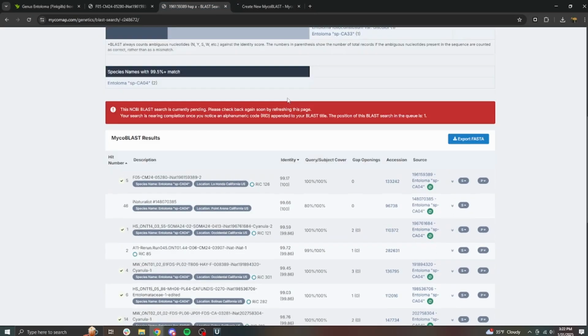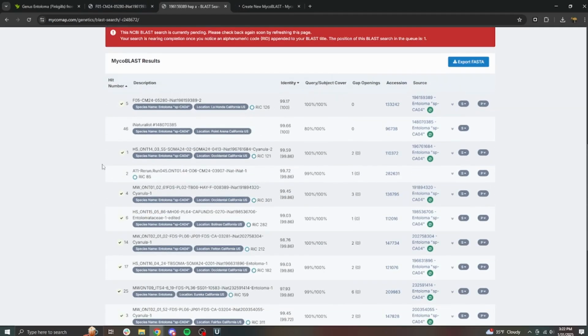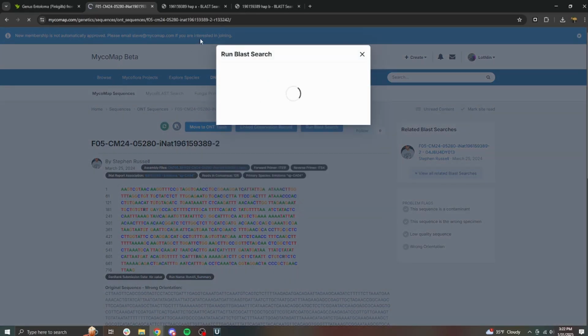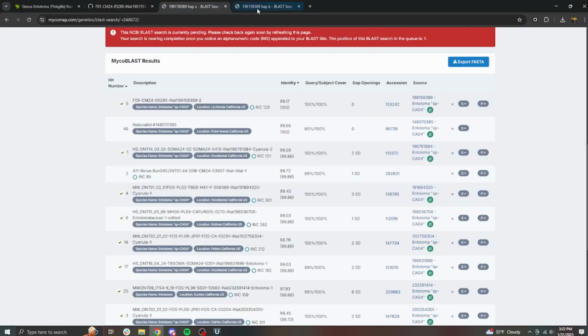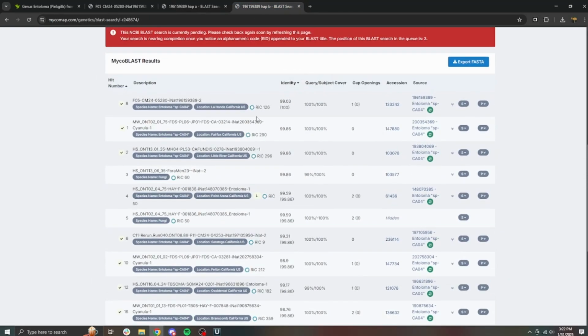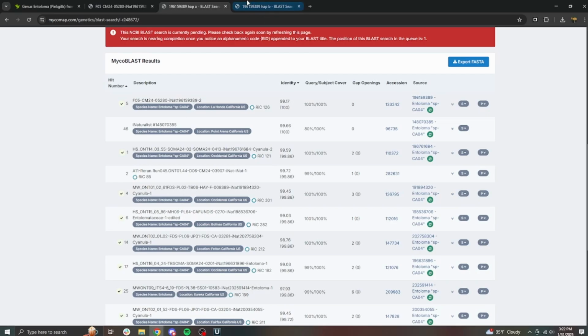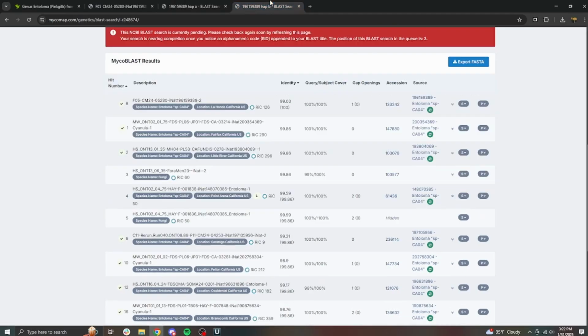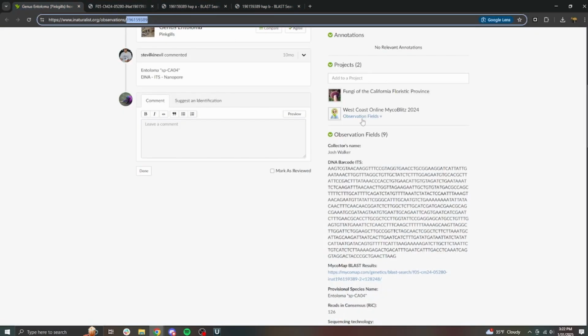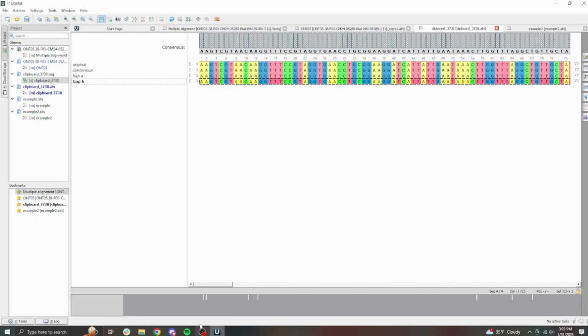All right. And then you'll get a blast that has the individual haplotype blasts. Then I'm also going to rerun the blast for the one that I edited. So I have my edited consensus sequence, I have haplotype A split out, and then I have haplotype B split out. And they're definitely matching slightly different things, but once I get this entire group cleaned up, I'm going to take a different look at it. There's a lot of sequences I'm cleaning up here. And then the last thing I generally do is, let's see, how many did I say? 1, 2, 6.